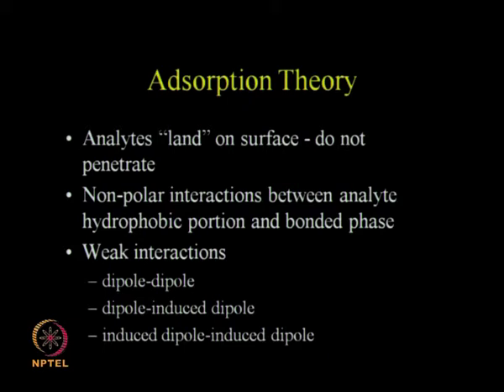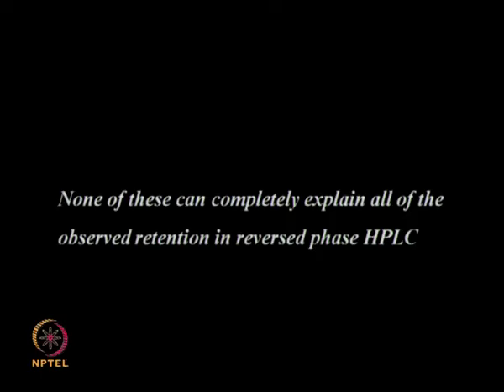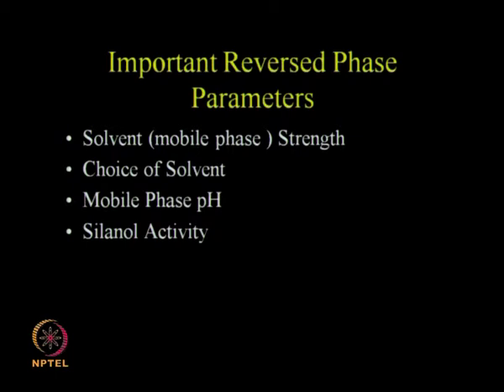So these are the three different theories which have been proposed to explain reverse phase chromatography, and in reality there could be combinations of all these three theories. None of these can completely explain all of the observed retention in reverse phase HPLC. So it is a combination of all these three actually.